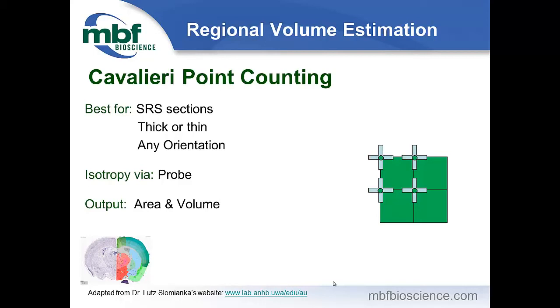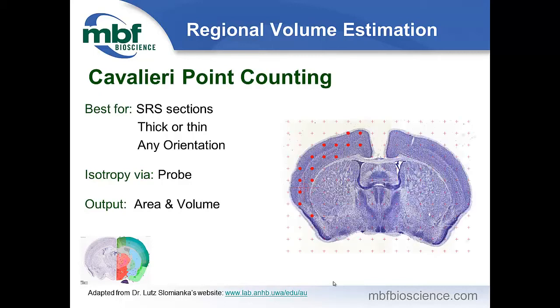And so it's a very straightforward way to get a quick estimate, because you are making fewer decisions about the location of the region. Right. So you have this three-dimensional solid, and what you do is you systematically and randomly section all the way through it. And now here's an example of one of those sections. Yeah, and so you can see here that the grid is randomly tossed onto the region of interest, and you would mark, as I did with these round red circles, the points in which the grid points fall over my region of interest, which in this case is the right cortex.